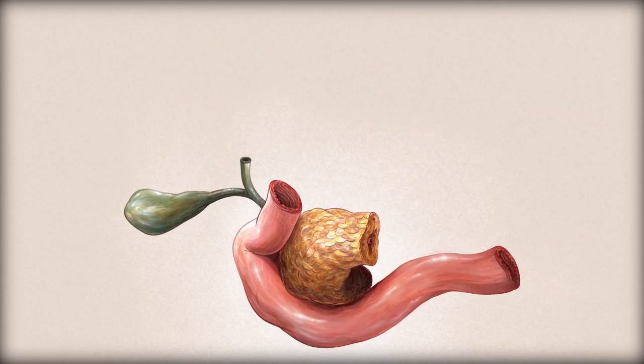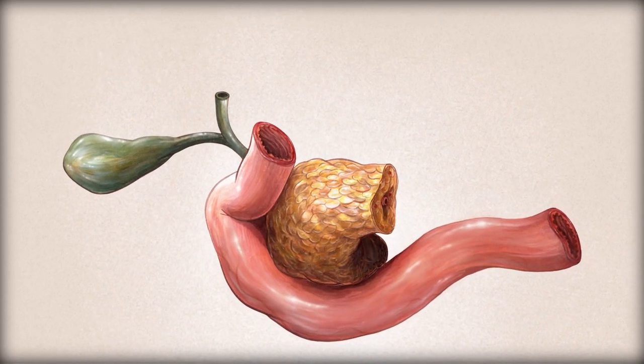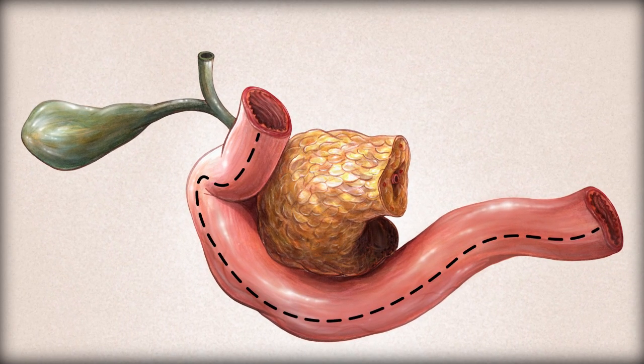After the margins have been taken, the specimen can be dissected. Open the duodenum longitudinally along its surface farthest from the pancreas. At this point, the pancreas may be bread-loafed. However, we will proceed to bisect the specimen along its duct systems instead.